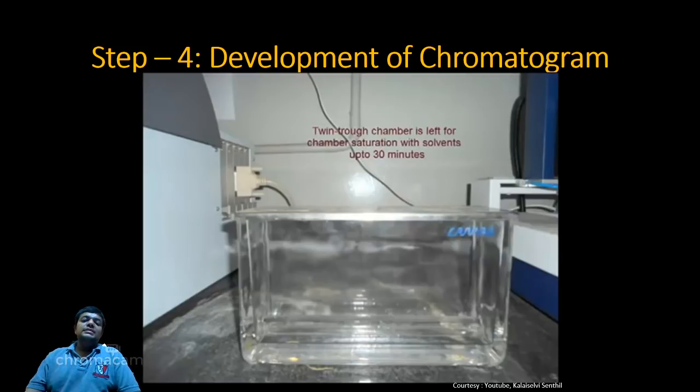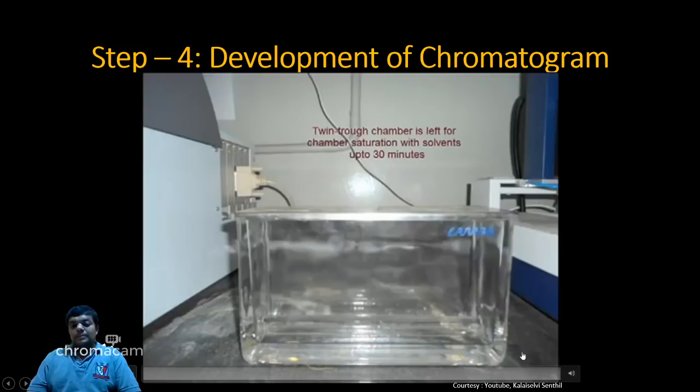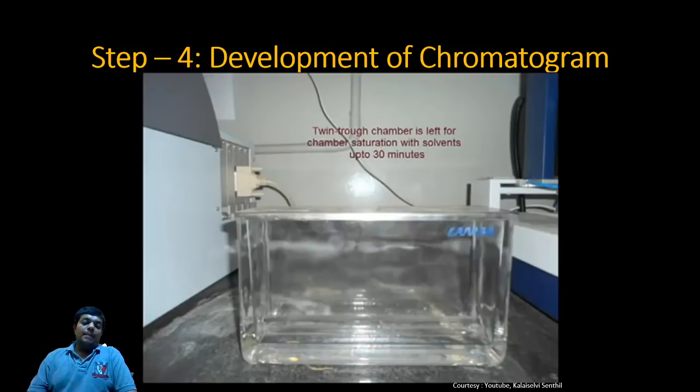See, this is a chamber made up of glass. At the bottom there is a mobile phase, and in this we are going to place our TLC plate. So see what happens.